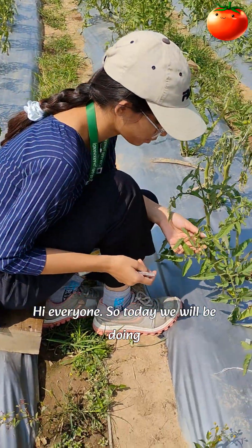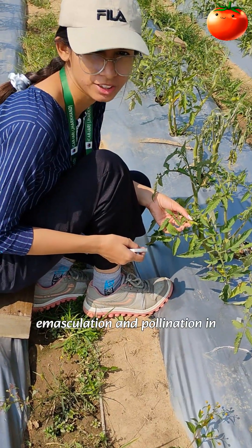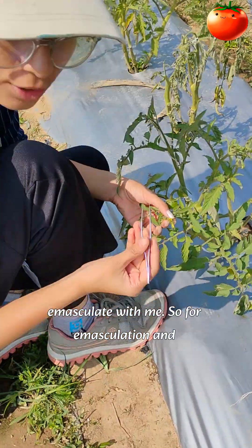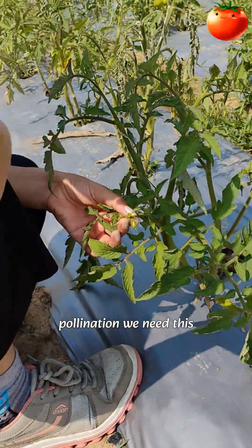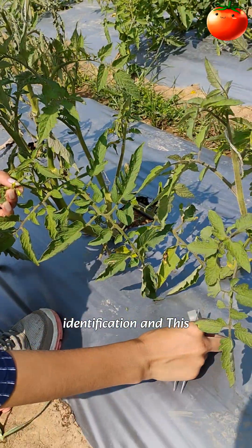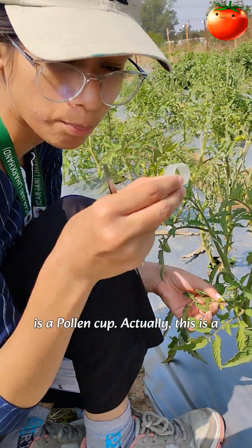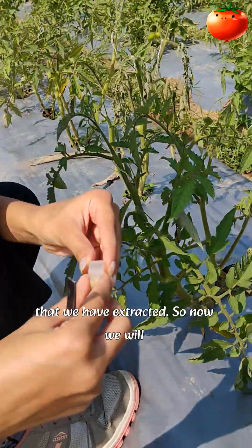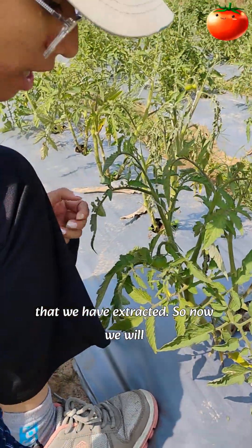Hi everyone, today we will be doing emasculation and pollination in tomato. For emasculation and pollination we need this forcep, we need a thread for identification, and this is a pollen cup — actually this is a ring and inside it there is pollen that we have extracted.